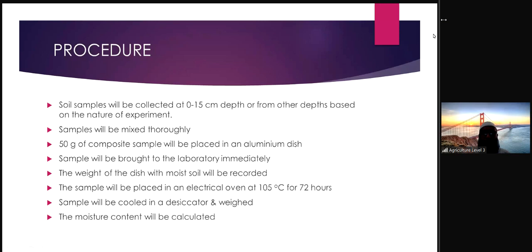So, you know my style. Actually, after doing this experiment, I will tell you to design a few plans, a few experiments in real life that could be used for different research.